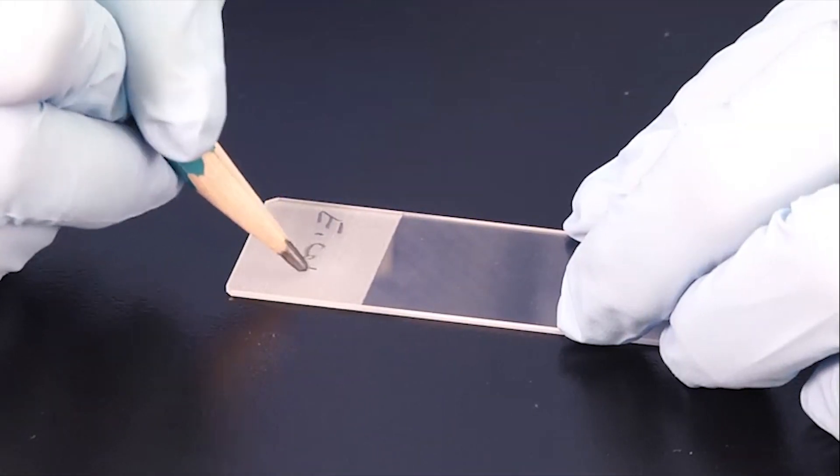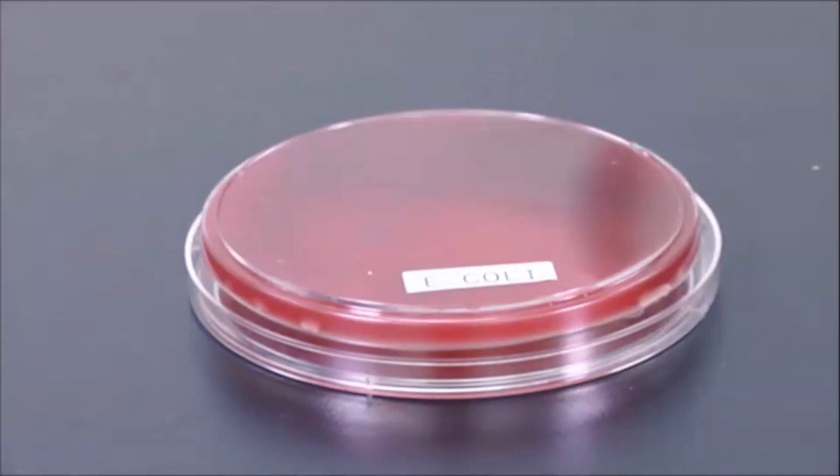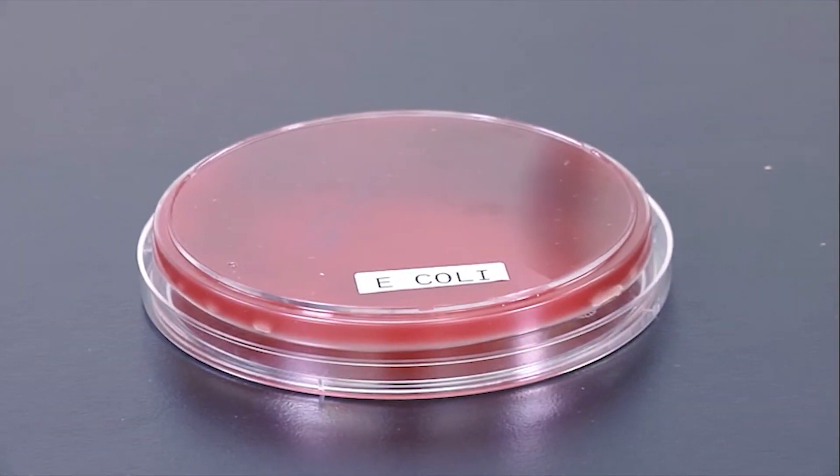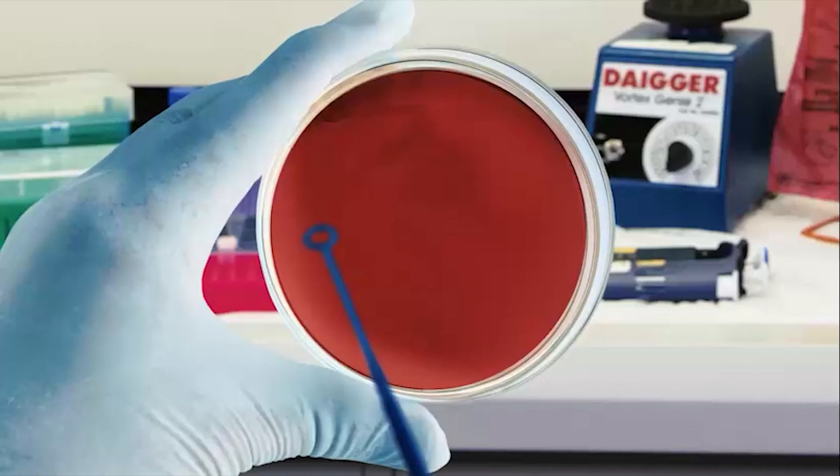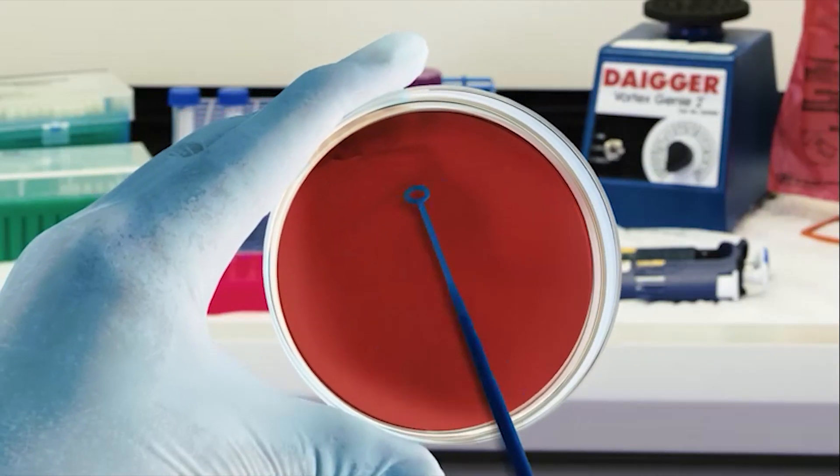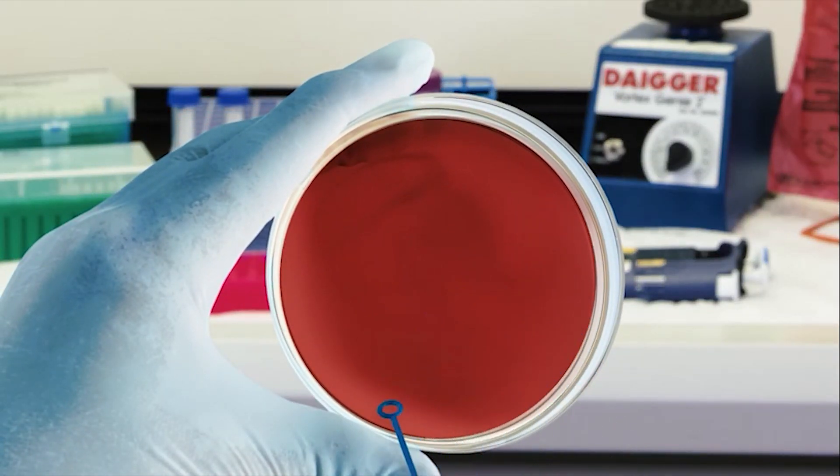A clean microscope slide is marked with the same identification as the plates for a particular specimen. The culture plates are then inoculated with a specimen, either a swab or fluid, and a clean labeled slide is inoculated with the specimen.